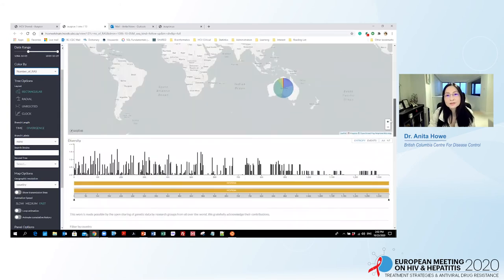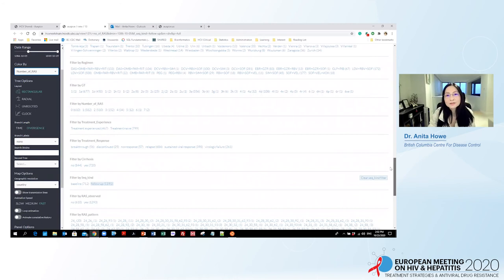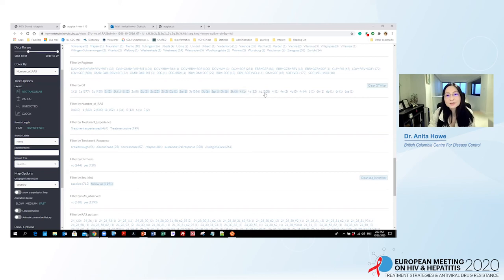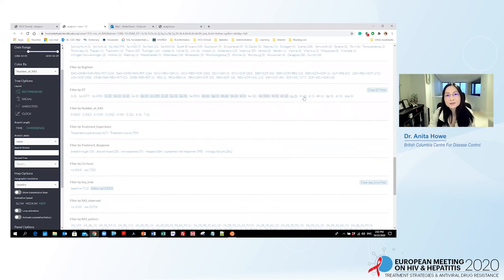For those infected with uncommon genotypes, we can once again use the filter to look at the virology profile of these subjects. Here I am selecting genotype 1i, 1k, 1l, etc. When I say uncommon genotypes, I mean they are uncommon in developed countries where most clinical trials took place — they may be common in other parts of the world, but have not been studied extensively. Now I have selected my whole collection of uncommon subtypes and genotypes.